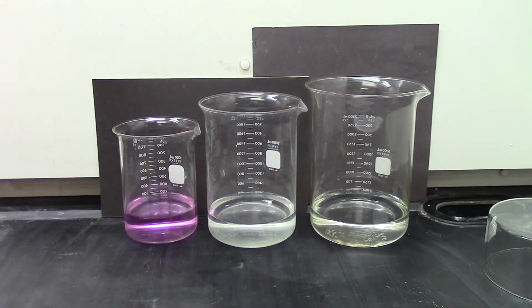Sodium is lower on the periodic table than lithium, and its valence electron isn't held onto as strongly. You can see that it's more reactive, and when it comes into contact with water, it generates so much heat that it actually melts. You can see that it's formed a bead as it's rolling around here on the surface.